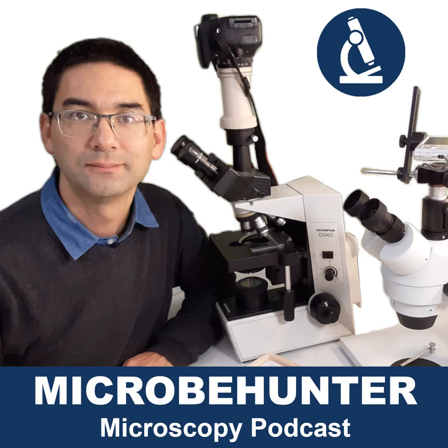Sometimes actually it's even more complicated than that, because if you have larger cells like protozoa and you want to look at certain structures inside the cell, then you have no possibility of changing the surrounding. You can change the surrounding mounting medium if you want to, but actually the object is inside a cell, and the certain cell organelles are inside the cell, and then the surrounding medium is the cytoplasm of the cell, and of course you cannot influence that. So you see that it's quite fascinating. There are many things that you can tweak around here. And these are basically the three reasons.